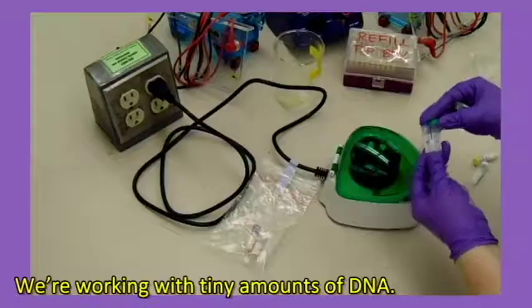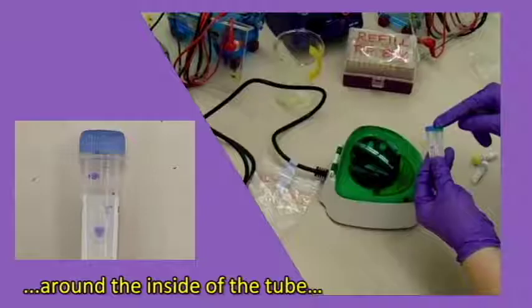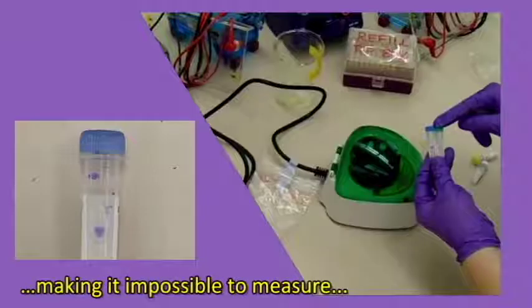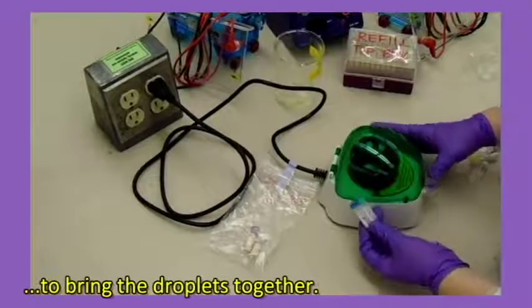We're working with tiny amounts of DNA. Sometimes the drop will be splattered around the inside of the tube, making it impossible to measure accurately with the micropipette. We use the microcentrifuge to bring the droplets together.